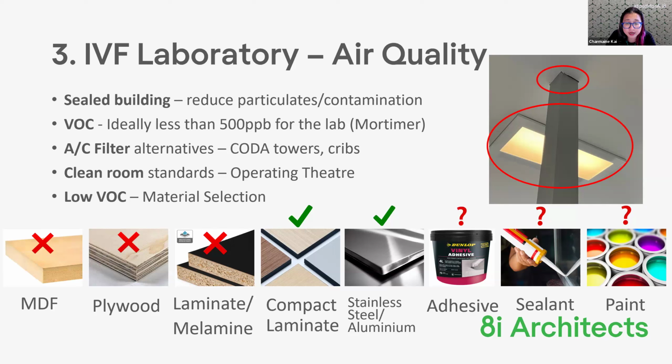You just have to watch with stainless steel, because it's actually quite thin. Normally it needs a substrate, so something underneath to support the stainless steel top, to give it rigidity so it's not flexing. A lot of times in Australia in particular, they will use plywood underneath the stainless steel to stiffen it up.